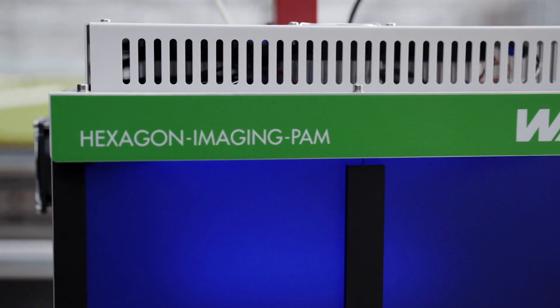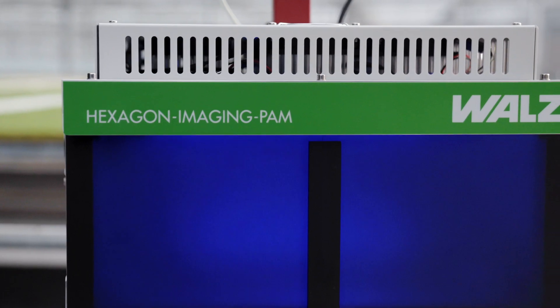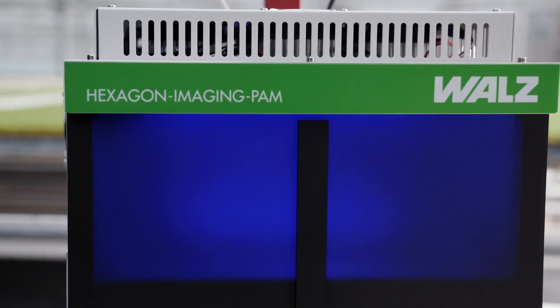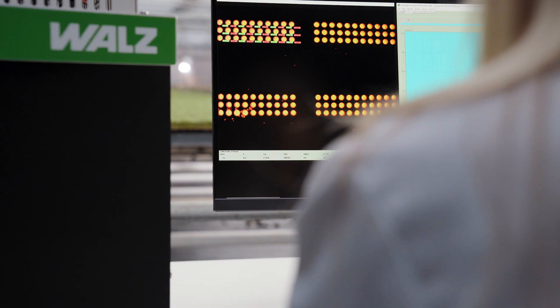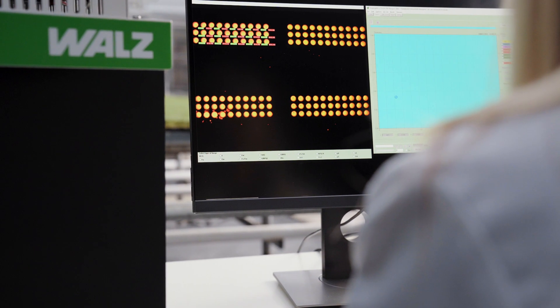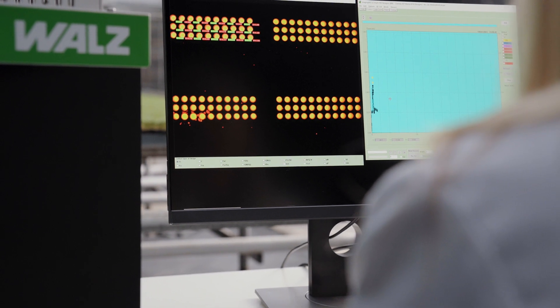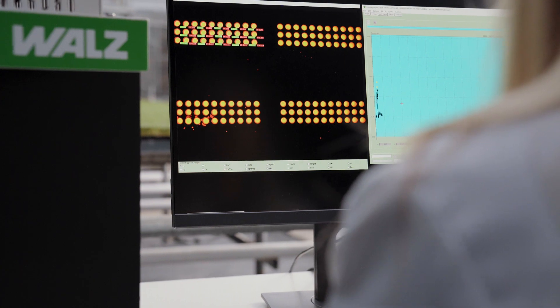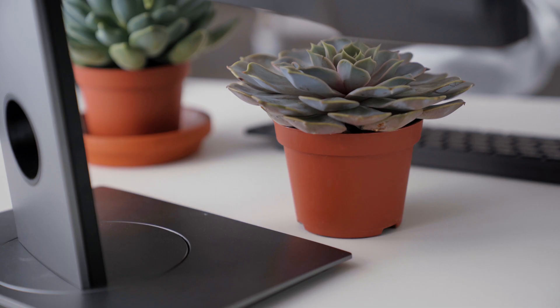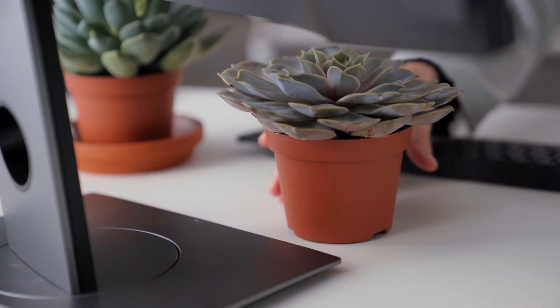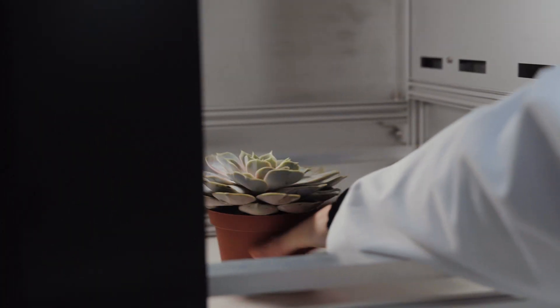Special attention has been paid to the LED array with powerful blue excitation and far-red LEDs for maximum light field homogeneity. The Hexagon Imaging PAM offers a very large sample area – 480 square centimeters are available for your application.